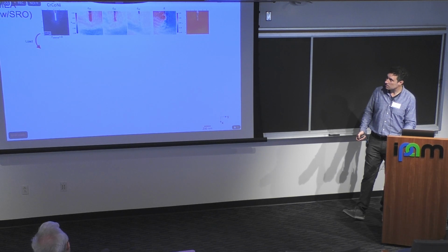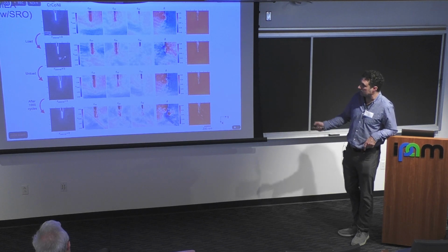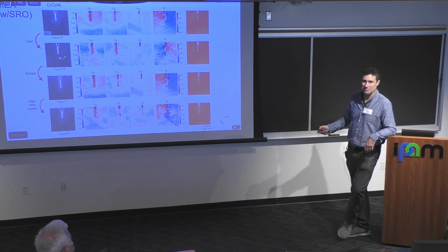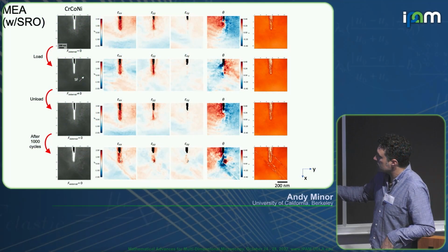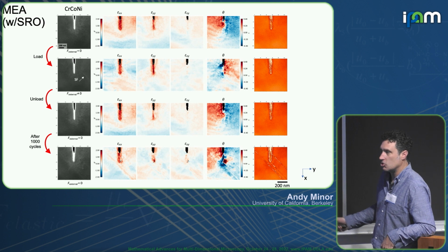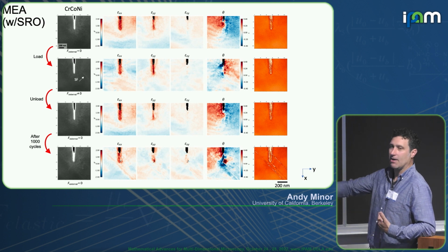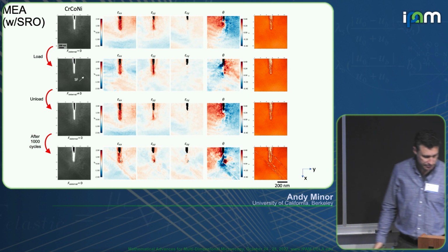And so that's the first step, and then here's 1,000 steps later. We didn't take data at every point, just did the first few and then skip to 1,000. And what you see is this, well, okay, it's all washed out here, but it's exactly what I showed you before. You got just a couple of things, they disappear, and then eventually they're permanent. So eventually you get these permanent lines in the scientific reality that are coming out, showing you that you've basically cleared out some sort of, presumably some short range order, and you've got now this permanent feature that is really a small, thin stacking fault.